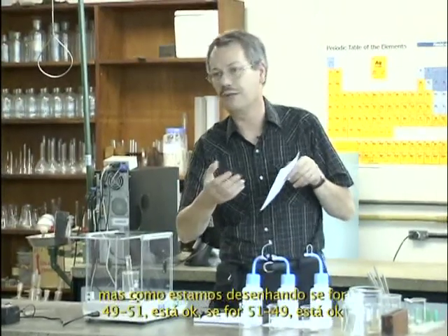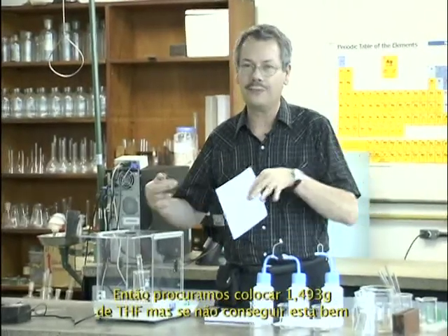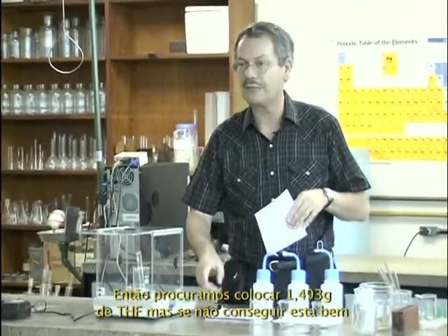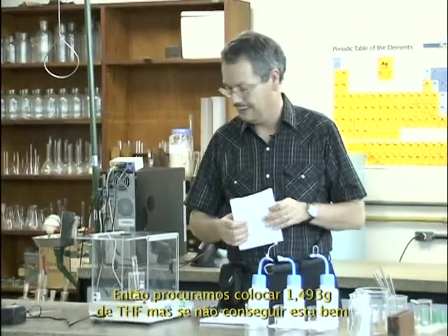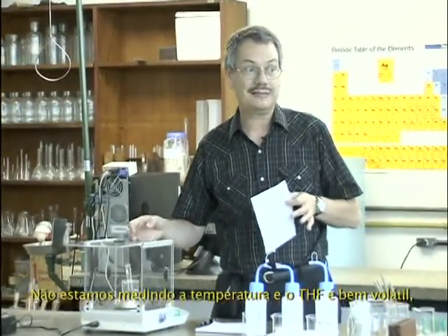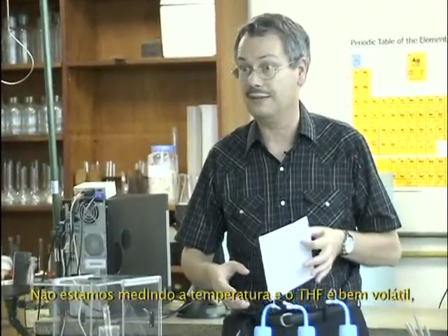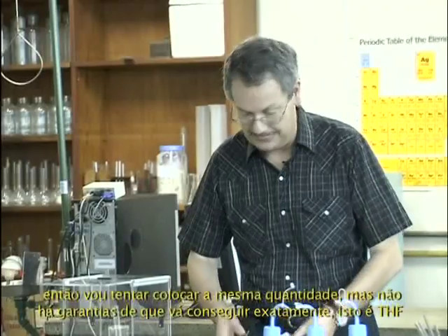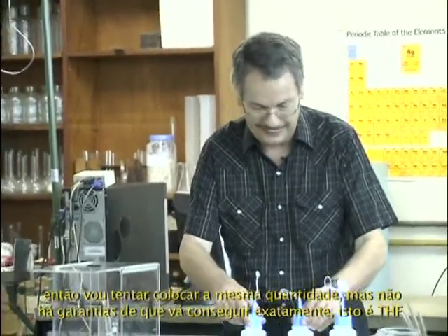If it's 51-49, it's okay. So you look to put about 1.493 grams of THF, but if it's not exactly that, it's okay. It will not be exactly that due to temperature, and THF is very volatile. So I'll try to put this amount, but I have no guarantees that I will get exactly this amount.